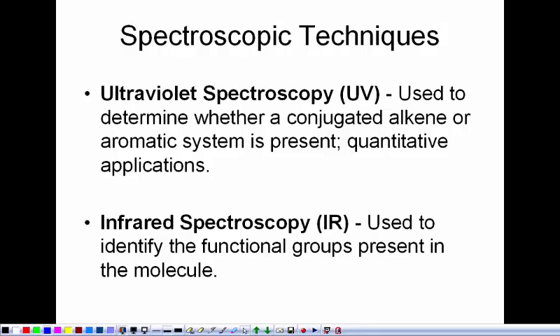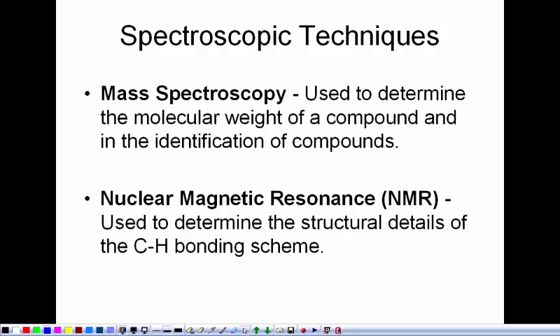And then there's mass spectrometry, which is used to get the molecular weight of a molecule and also the identification of it. If you watch any forensic shows, whether they're made up, like all the CSIs, or Crossing Jordan, which isn't on anymore, or NCIS, or there's so many of them out there, or the ones on Court TV that are real, you'll oftentimes hear about the GC mass spectrometer, which is the tool that everybody uses to solve everything besides DNA.